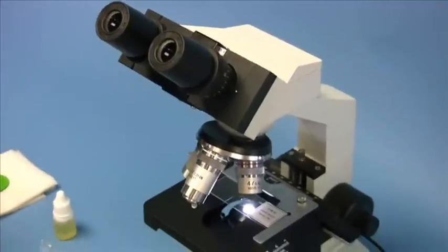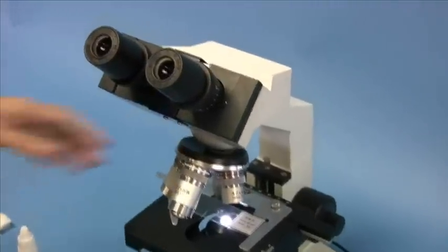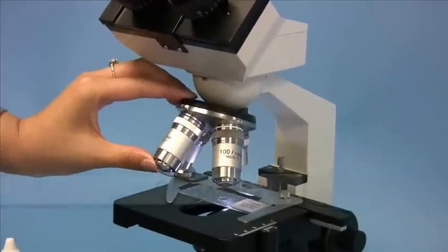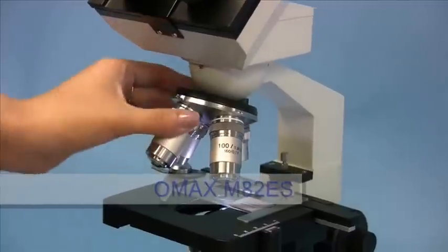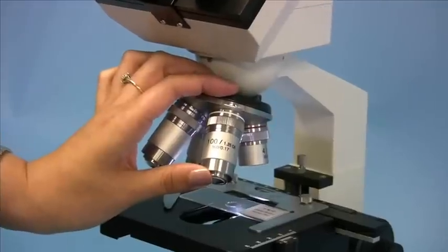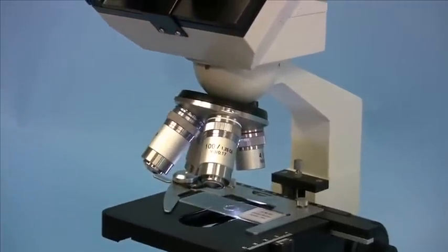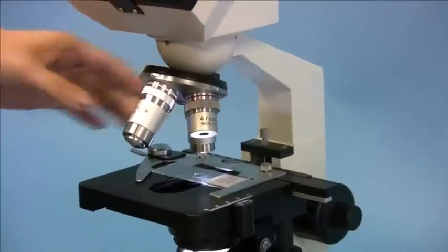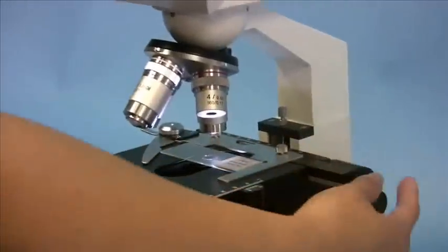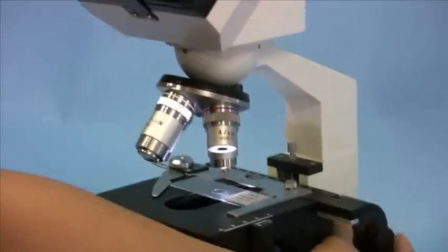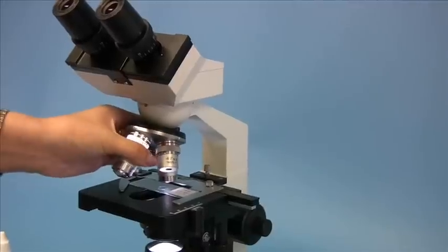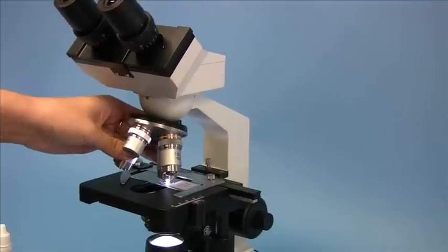Specimen might differ in size, so you might want to use different objectives, such as the 40x or the 100x. Before using them, make sure that the spring moves smoothly and is not stuck. The proper way of focusing is to start using the 10x objective. Use the coarse and fine focus adjustment knobs. Once you get the image focused under the 10x objective, you can turn the 40x objective into position.